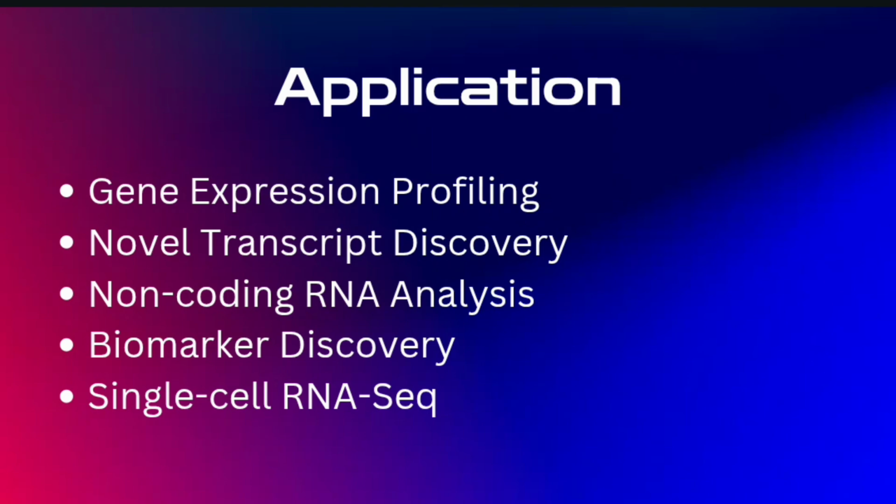Then, non-coding RNA analysis helps in studying regulatory RNAs such as miRNA or lncRNA. Biomarker discovery helps in identifying gene signatures for diagnosis or treatment. Single-cell RNA-seq analysis helps in revealing gene expression at single-cell levels.